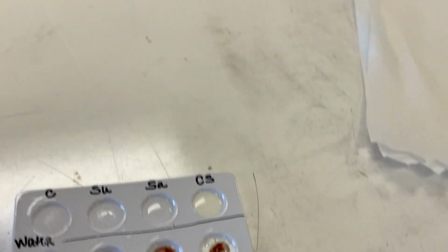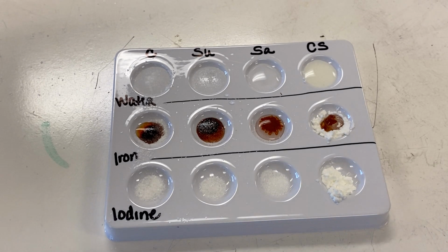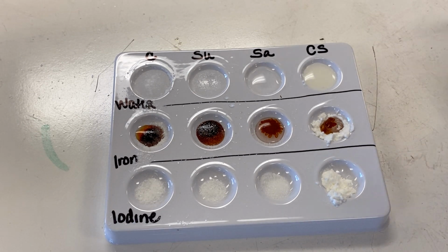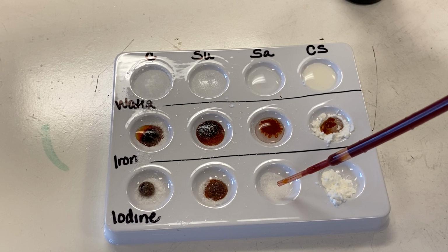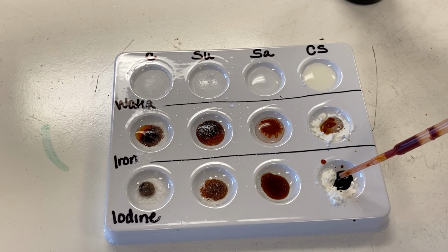All right, now the last step is going to be adding the Lugol's iodine to the mix. So the final step is a couple of drops of the Lugol's iodine in the row labeled iodine. So let's see what happens with Lugol's iodine here. Look at that turning almost black.